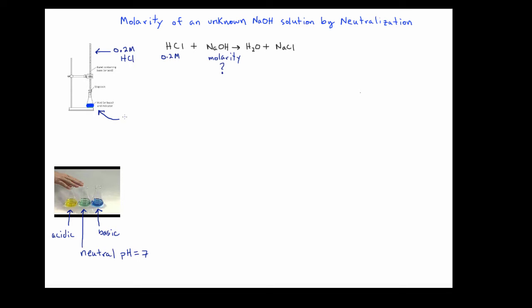This is unlike some of the previous labs described in the first two videos. In this case, the student is going to carefully measure out 20 milliliters using a graduated cylinder of unknown molarity NaOH solution. This is a colorless solution and it will be measured using a graduated cylinder and added very carefully to the collection flask.